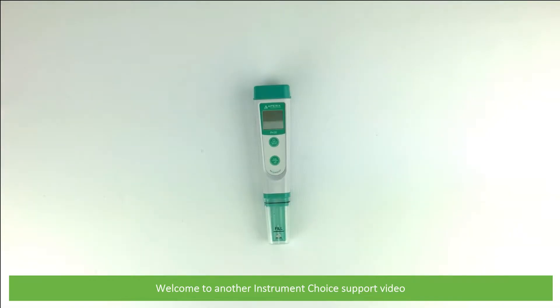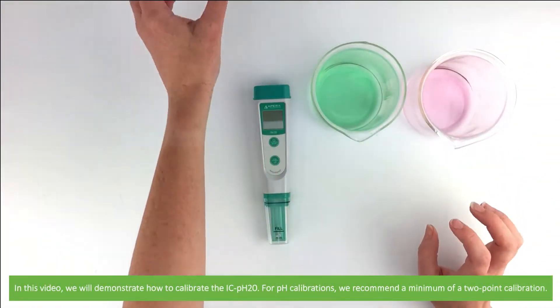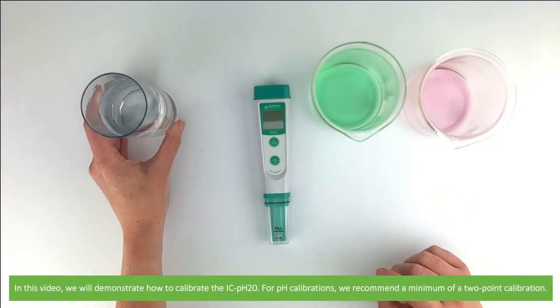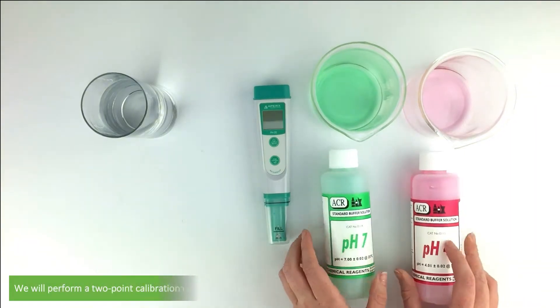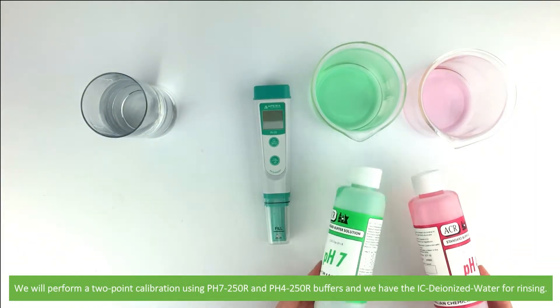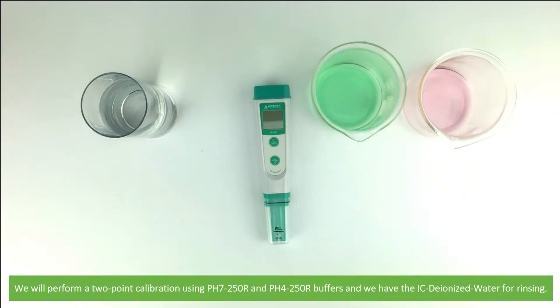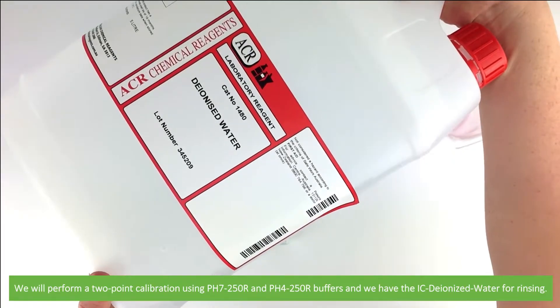Hi and welcome to another Instrument Choice support video. In this video we'll demonstrate how to calibrate the IC PH20. For pH calibrations we recommend a minimum of two-point calibration, so we'll perform a two-point calibration using PH7250R and PH4250R buffers, and we have the IC deionized water for rinsing.